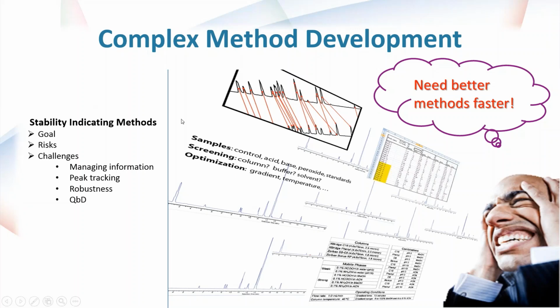Some of our customers, such as Charlie, said that they would keep track of all these experiments in an Excel spreadsheet. At ACD/Labs, we refer to that as dead data because there's no convenient way that you can go from a spreadsheet back to the analytical data to interrogate what you were observing.